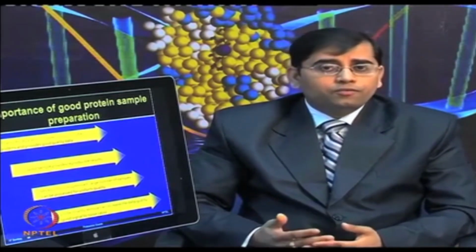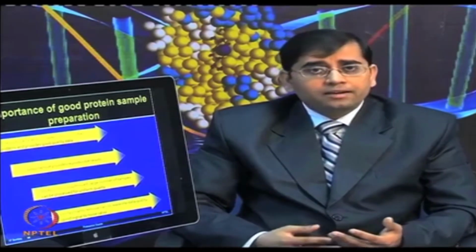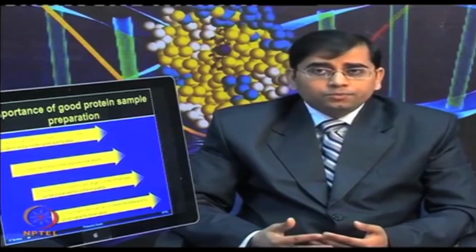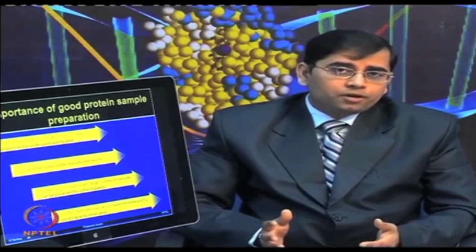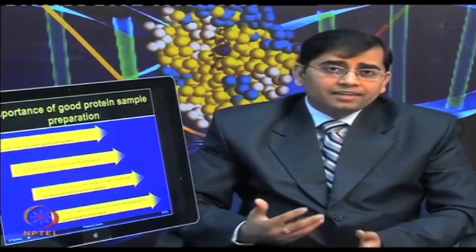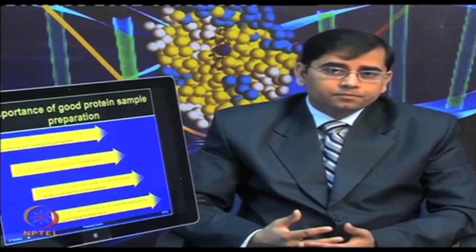Once you have optimized a protein extraction protocol, then you can apply the same protocol for large studies. For example, if you are performing a clinical trial study on 200 patients, once you have optimized the protocol with a small population, then the same protocol can be applied to a large number of samples. So, that is going to ensure the success of the clinical studies.